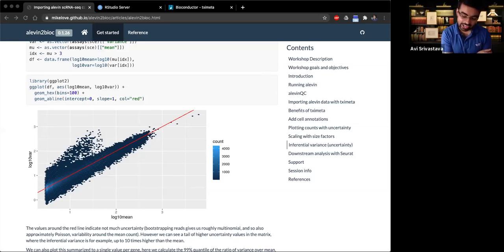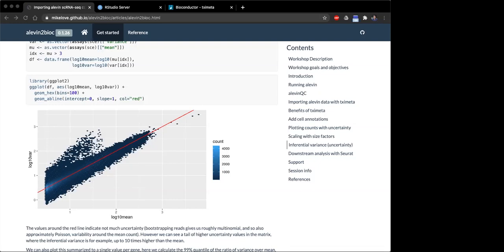Okay, I thought in sci-RNA-seq you have multiple rounds of barcoding and everything, so even though the library is separate, you have to quantify them together. But maybe I'm not sure. I still have to experiment on that. Okay, well, they keep changing what they're doing, so it's always a game of trying to keep up. Thank you. Yep. All right.